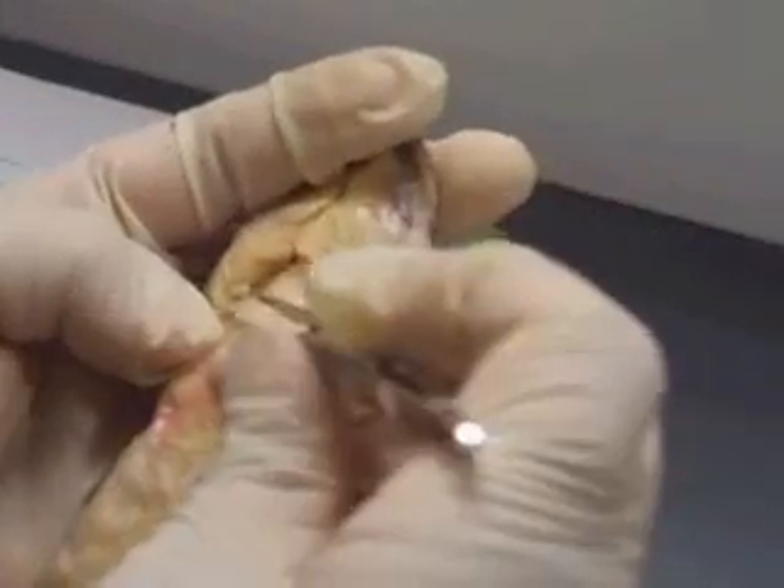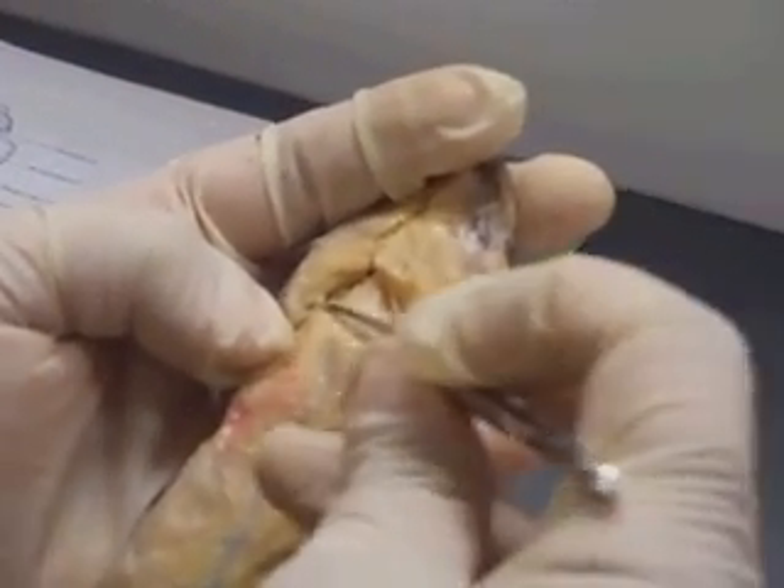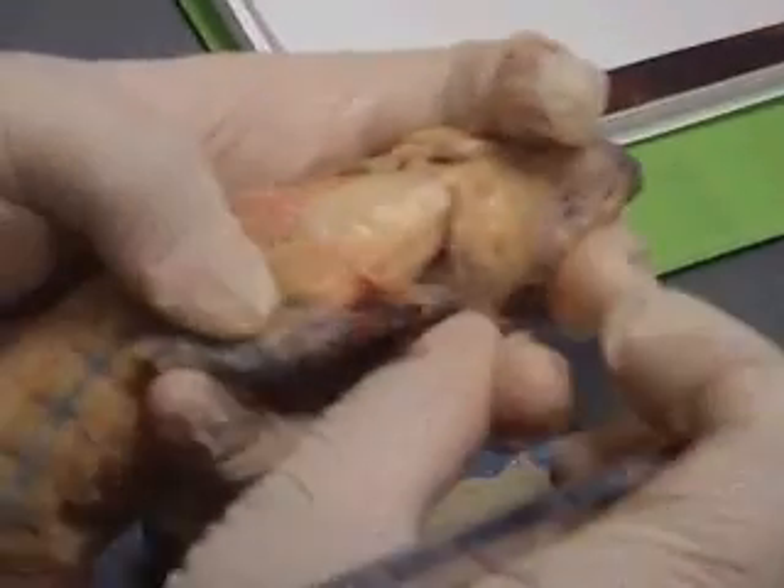This one running along here is your rectus cervicis — rectus cervicis, that one. Now, what we're actually looking for is where these are inserting at.